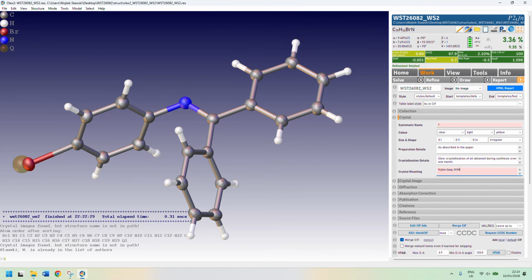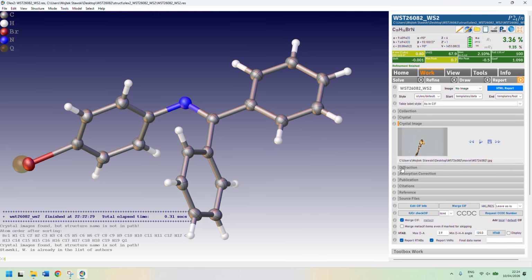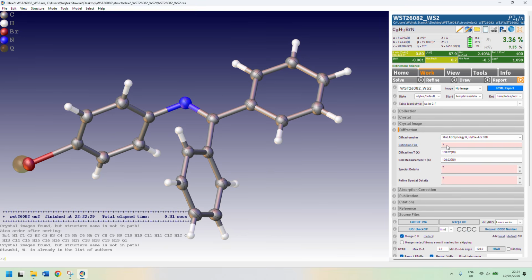NVH oil. It's a very dense oil. It's essentially like paratone oil, which is also a type of dense oil that is very useful. The trick is that you can't really buy paratone oil anymore, and you can buy NVH oil. So that's what I used. Although I have a small amount of paratone oil that I, well, might have borrowed from someone without their knowledge, but we're not going to talk about it right now.